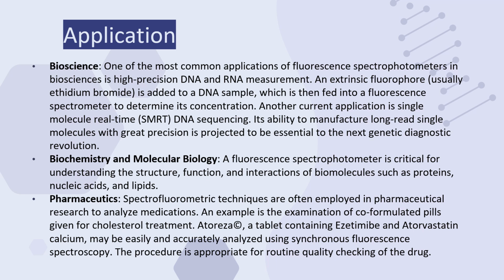The second application is in biochemistry and molecular biology. A fluorescence spectrophotometer is critical for understanding the structure, function, and interaction of biomolecules such as proteins, nucleic acids, and lipids. The third application is in pharmaceutics.